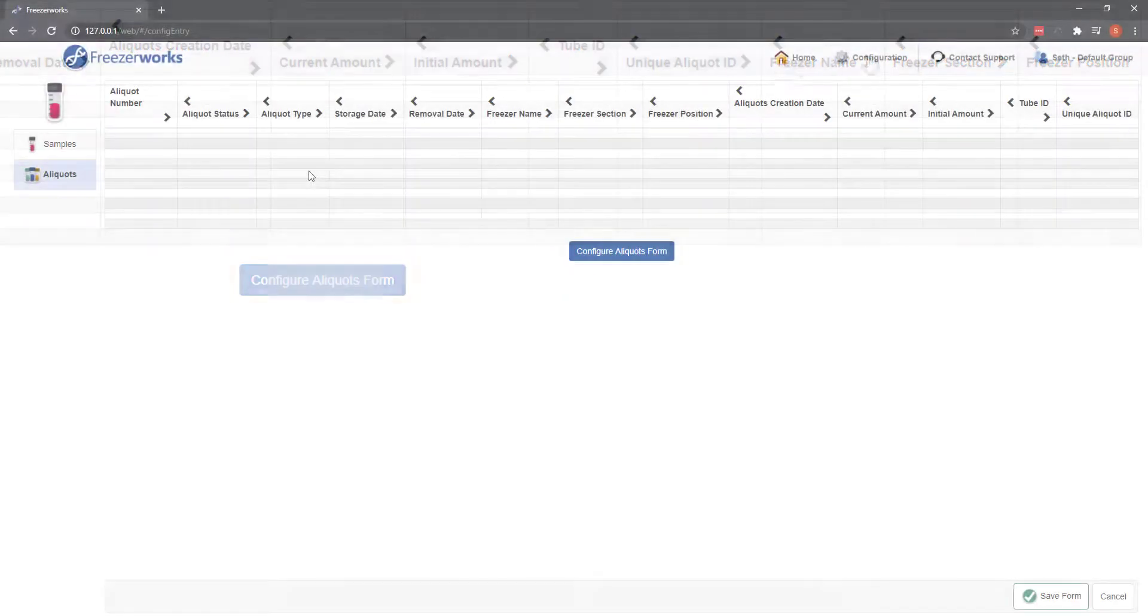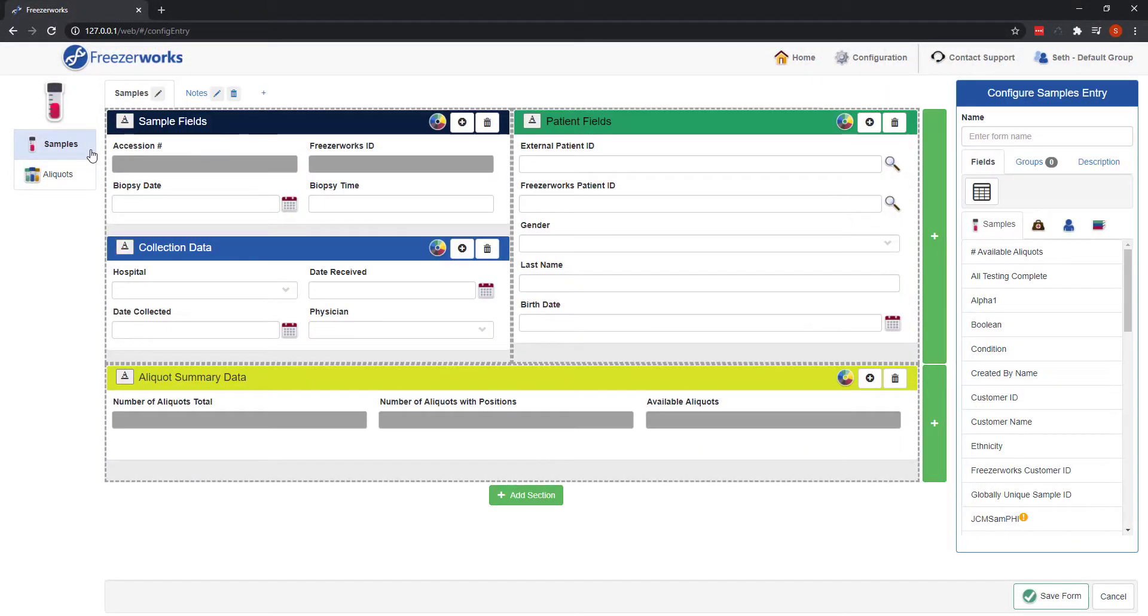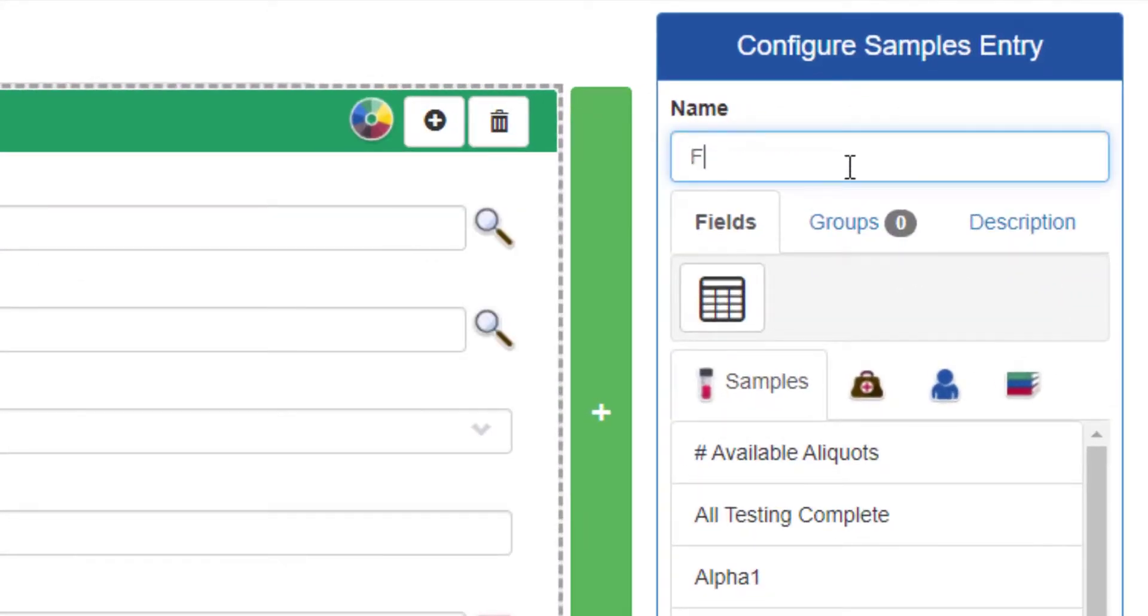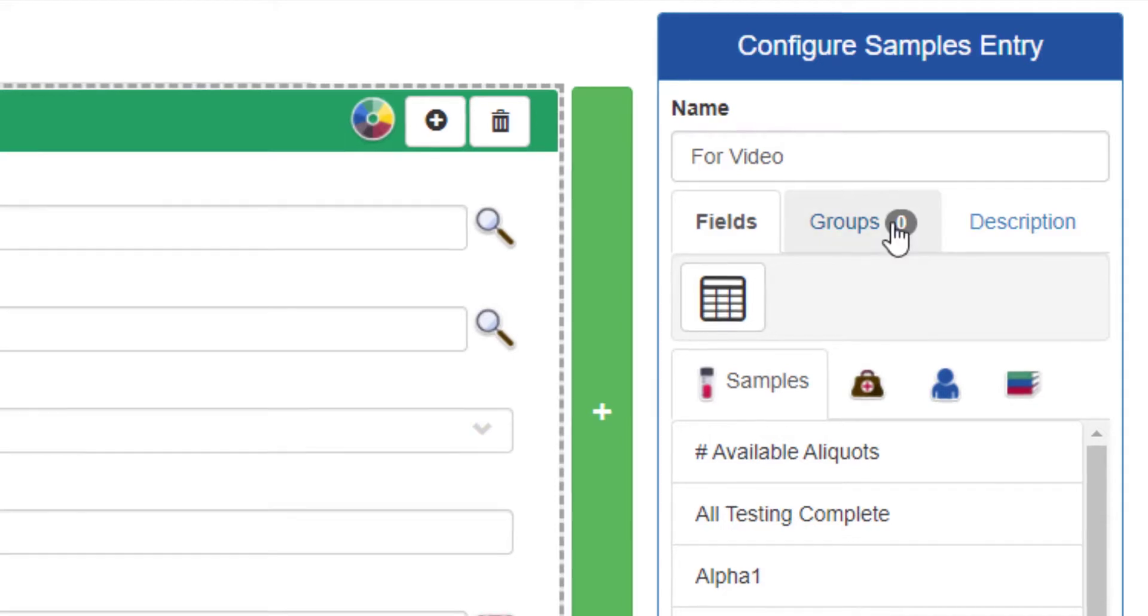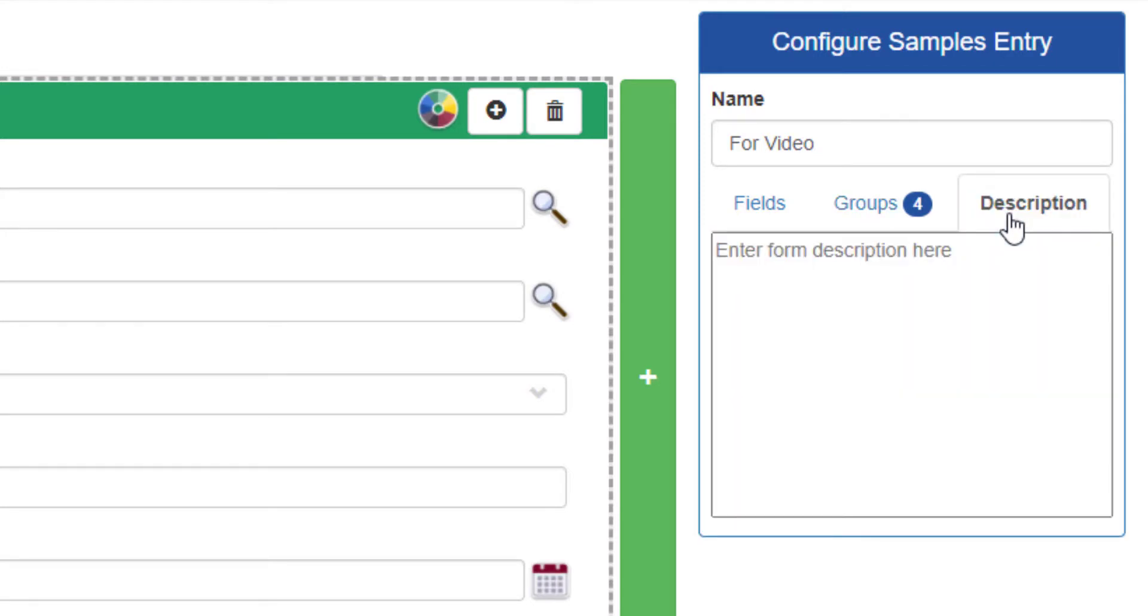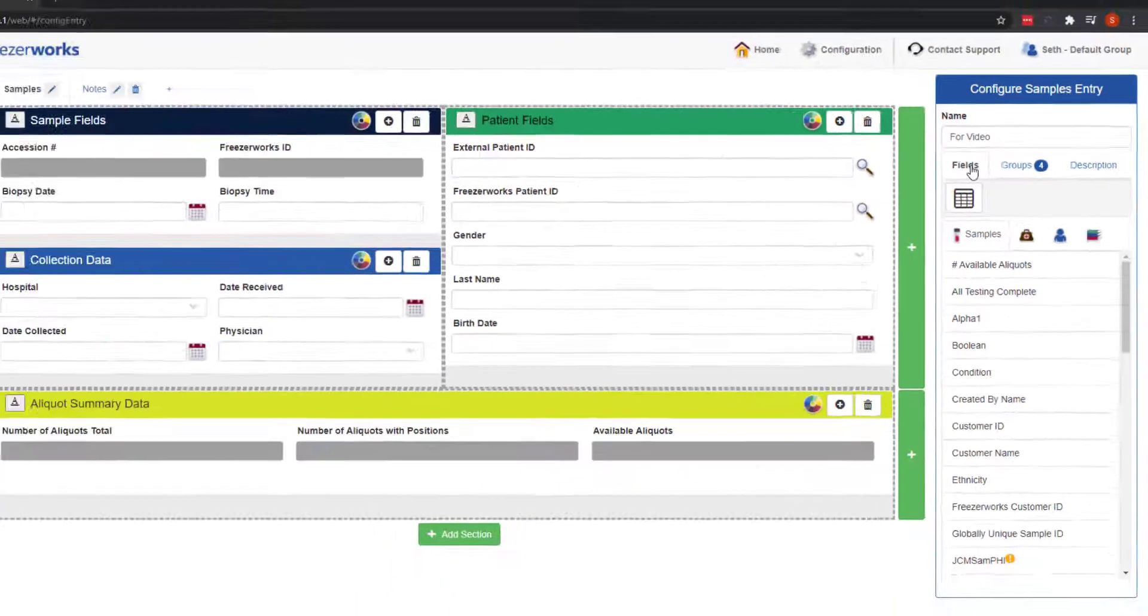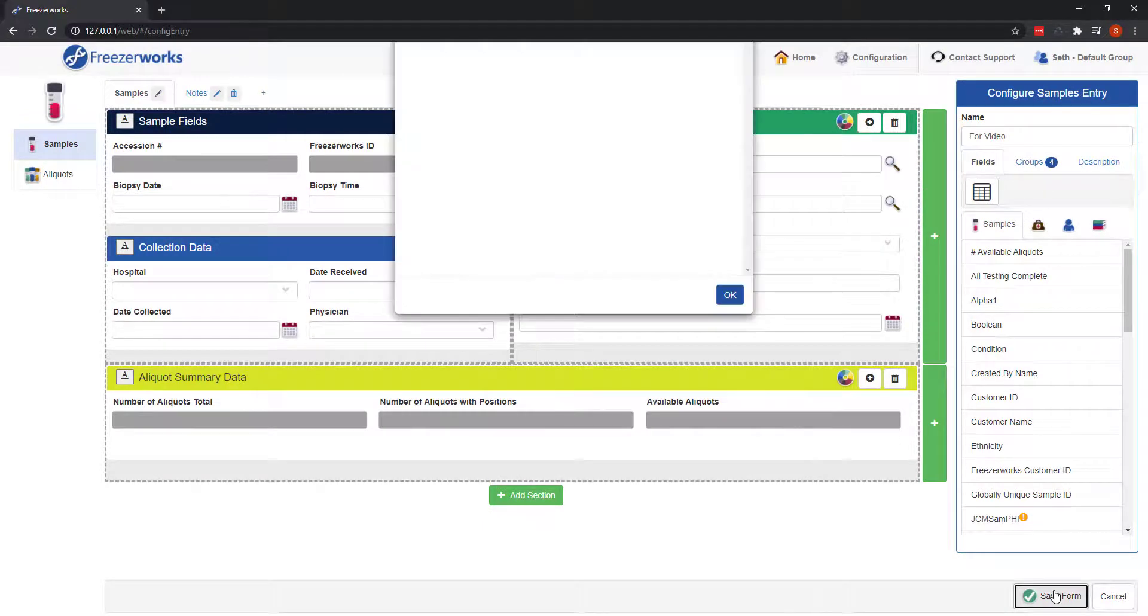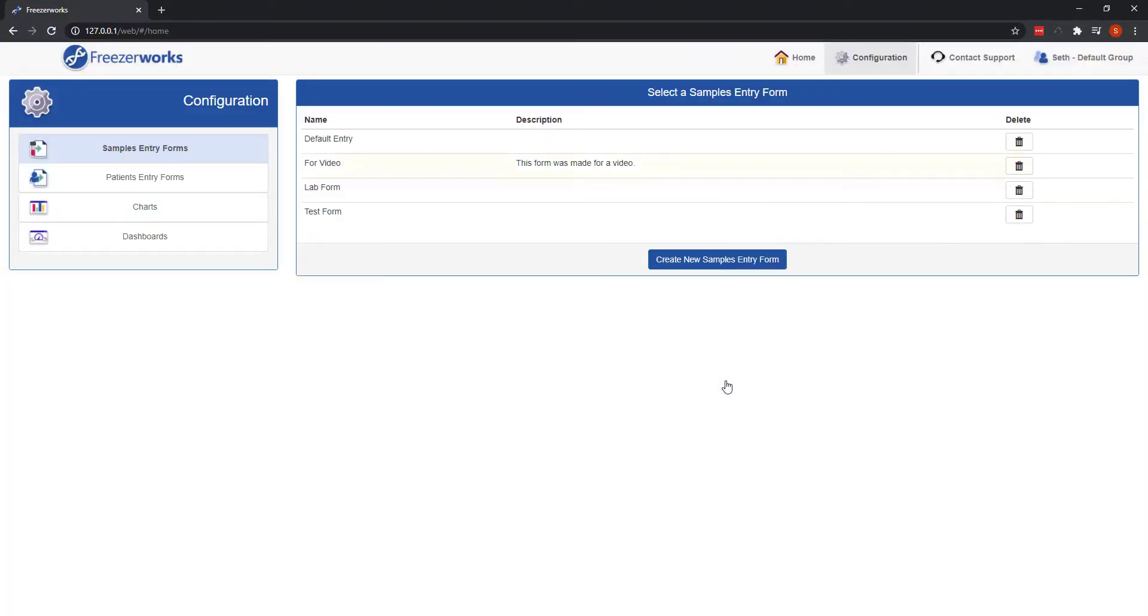We're almost done now, let's just return to the samples page and do a few final things on the palette. First, enter a name for the form, based on what's on it, or who will be using it maybe. Next, we need to assign the form to the groups that need it. Click this groups button, and then simply select the desired groups from the list. Finally, if you'd like, provide a description for later users who might need to update the form. Now that we're done, click save form, and you'll be returned to the list of samples entry forms, with our new one now listed. You can continue to create forms, edit others, or check out the one you just created in action.